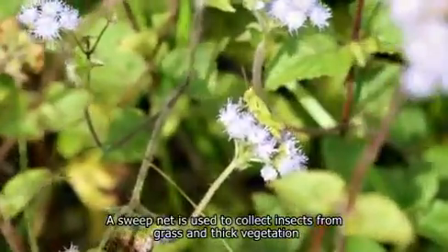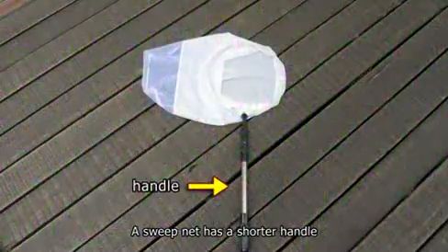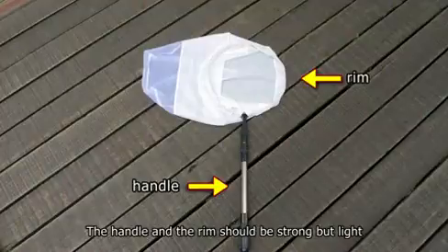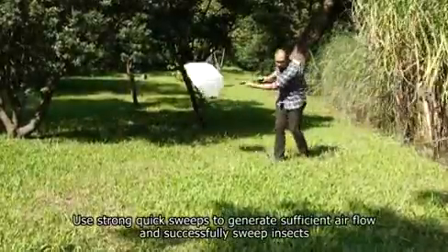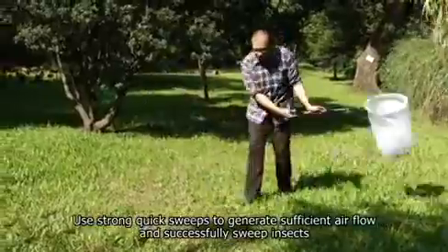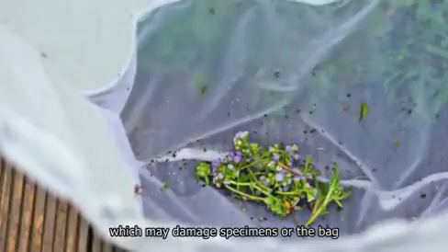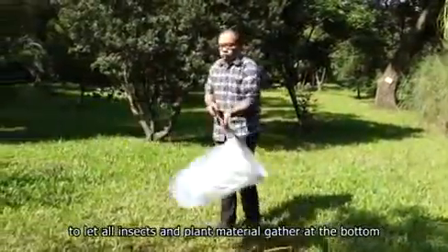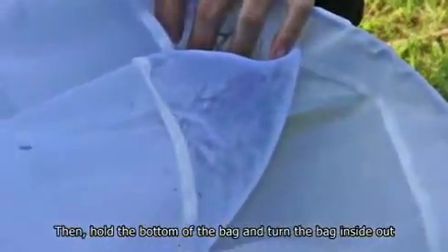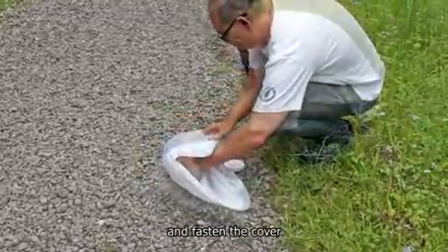Sweep net. A sweep net is used to collect insects from grass and thick vegetation. The collector moves back and forth while sweeping to collect insects at random. A sweep net has a shorter handle; the handle and the rim should be strong but light. Its bag is mostly made of canvas or muslin cloth. Use strong, quick sweeps to generate sufficient airflow and successfully sweep insects. Do not sweep for too long to avoid collecting too many insects in the bag, which may damage specimens or the bag. Finally, forcibly swing the net several times in the air to let all insects and plant material gather at the bottom, then hold the bottom of the bag and turn the bag inside out to quickly stuff everything inside the killing jar and fasten the cover.